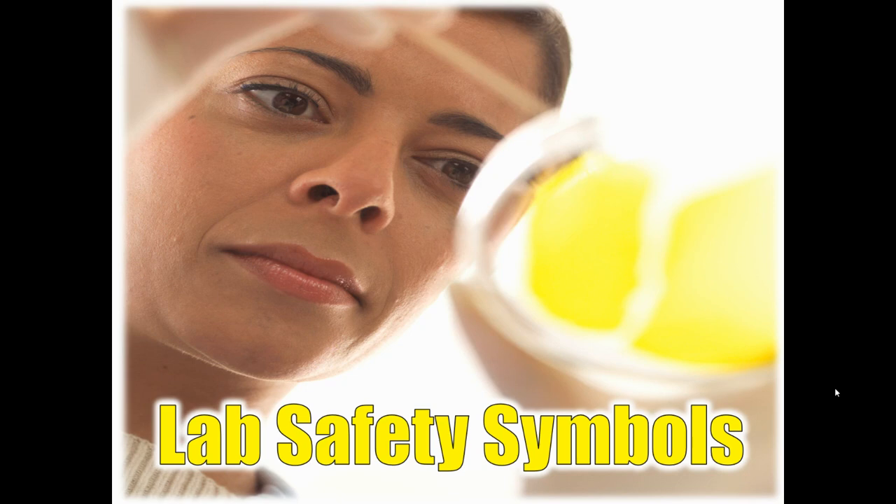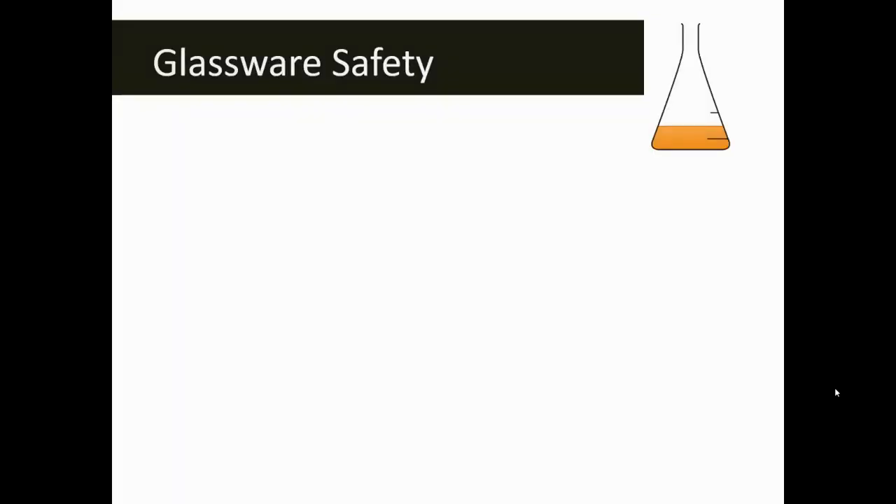We're going to be doing a ton of labs this year, so it is very important that we're all on the same page with regards to lab safety. We're going to go through just a few of the safety symbols that we might see this year and how they apply to the labs that we're going to be doing.